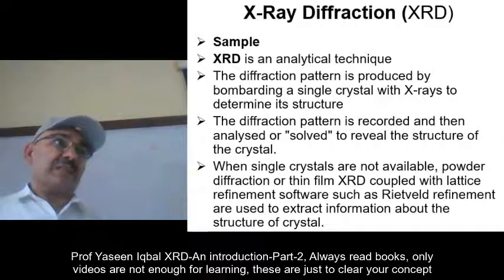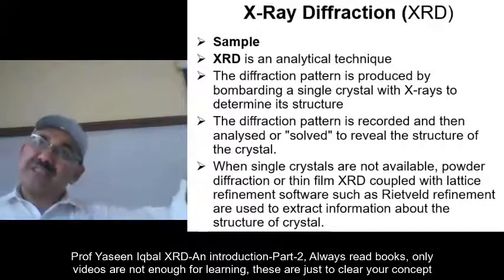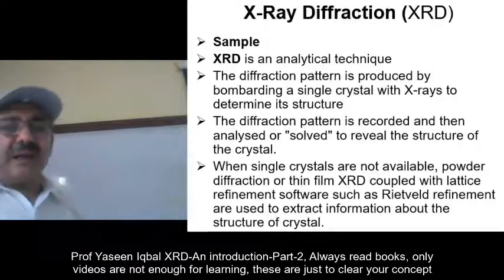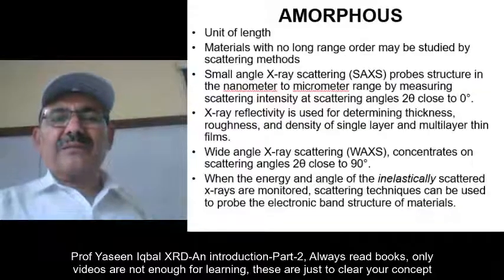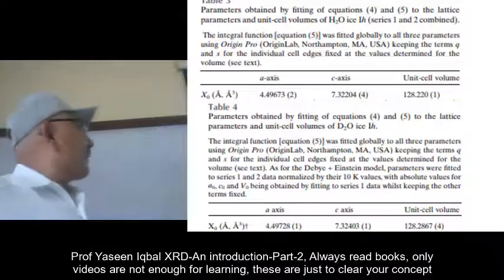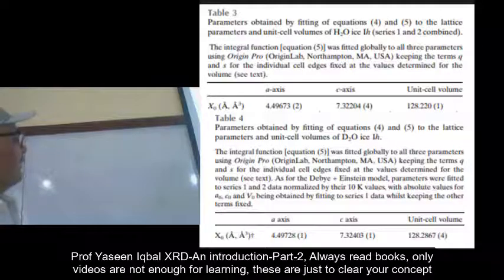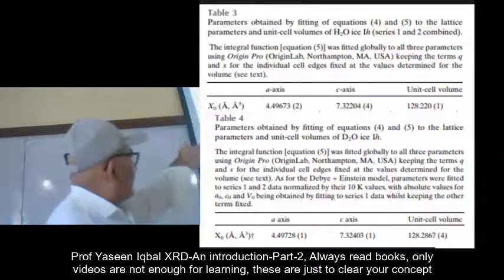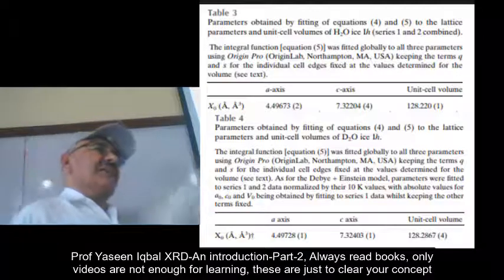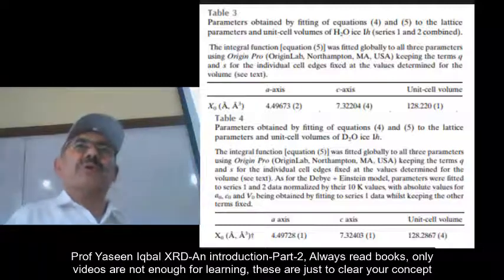If you go to the lowest level, it will be a micron. So always above that. And the dimensions of the unit cell, I hear for you, found in a paper published in 2018, probably American Ceramic Society. These are the latest parameters, A and C of H2O and A and C of D2O.